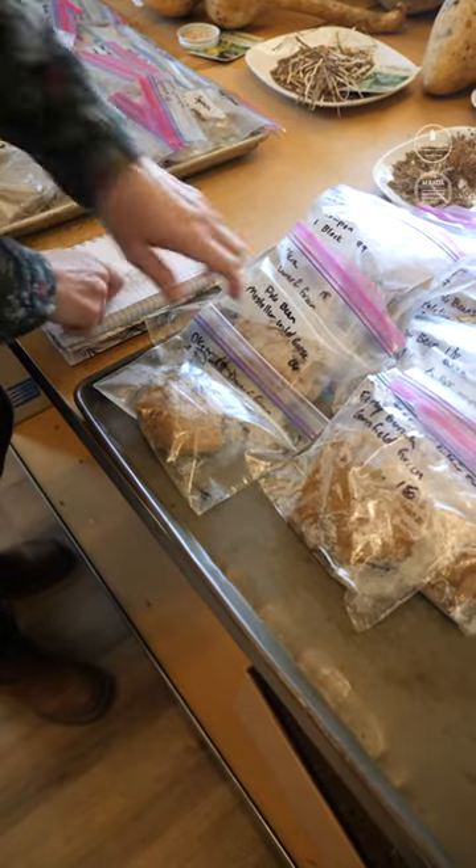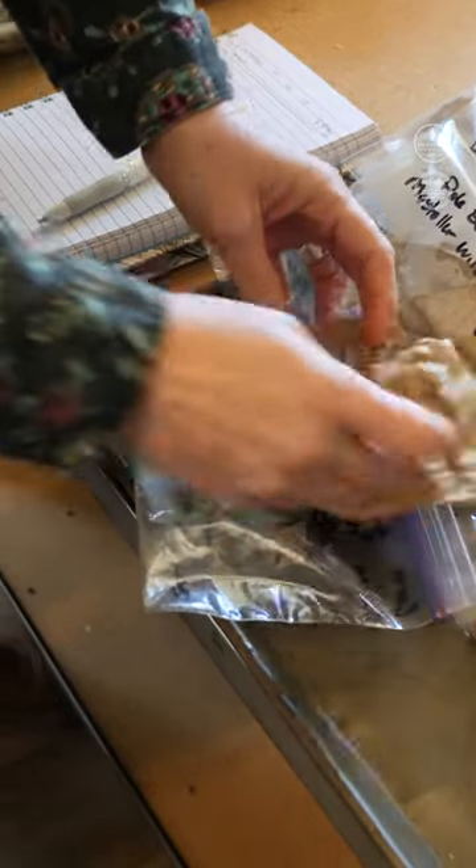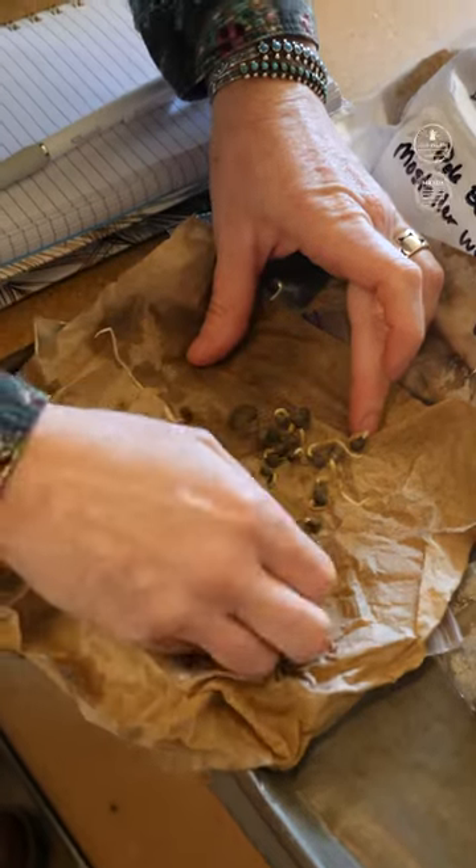Next we have okra dwarf green variety from 2019. It's growing through the paper towel — all but two.